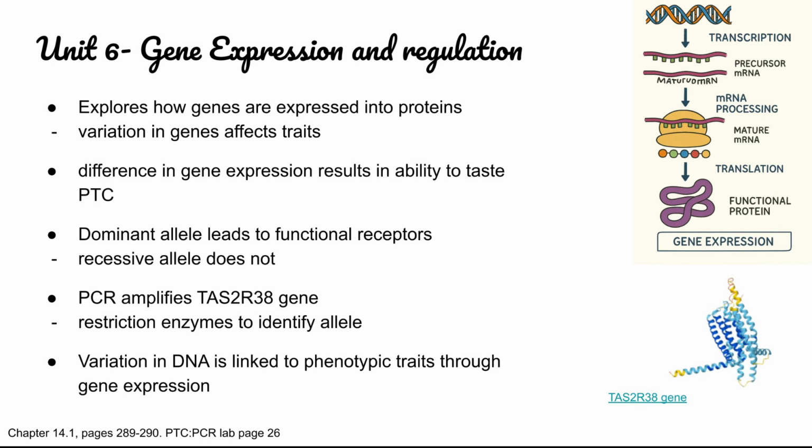We amplified the gene using PCR and then used restriction enzymes to analyze the version present. This experiment showed how even single nucleotide differences can alter gene expression and affect traits.